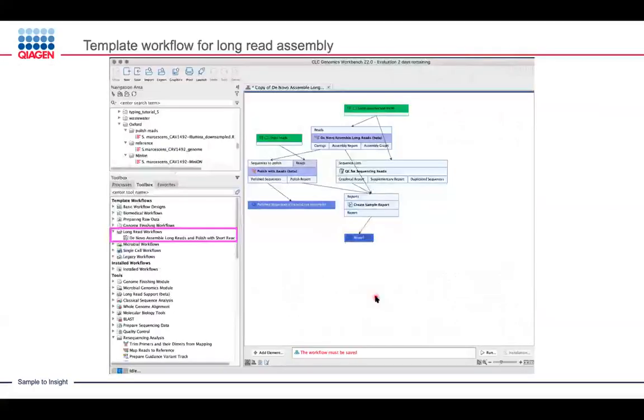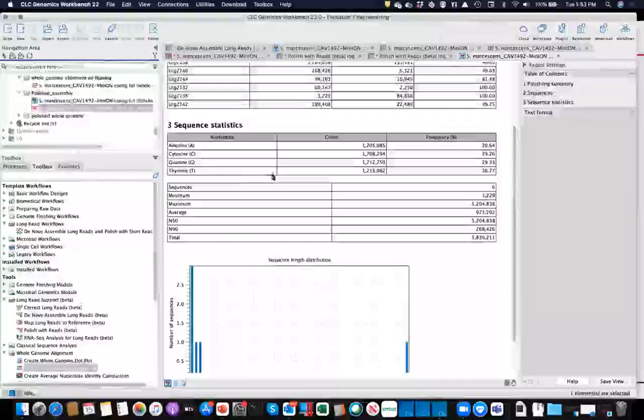And then to the point that I had just made, when Kyle had asked, well, do we add both reads at once? And do I have to do this as 2 different steps? Really, there's a template workflow that can be utilized. So all you're going to be doing is defining the long reads, the short reads, and any unlocked parameters that are here, which I can show you very quickly.